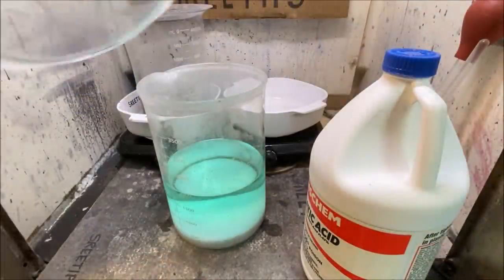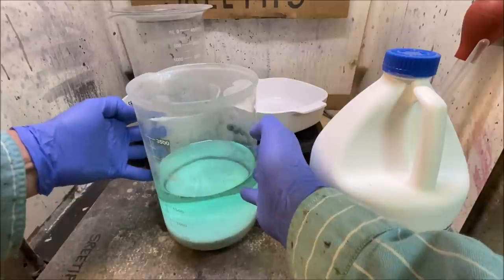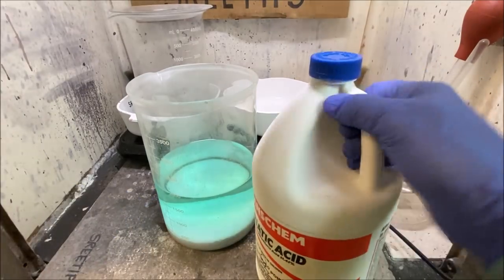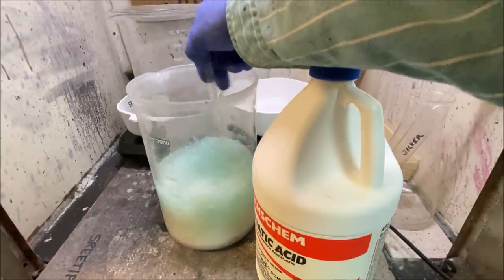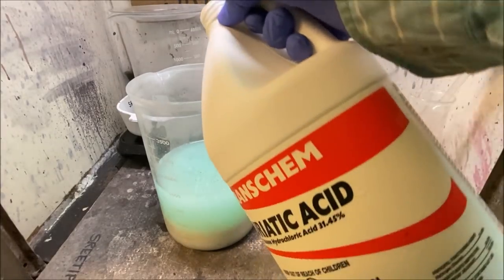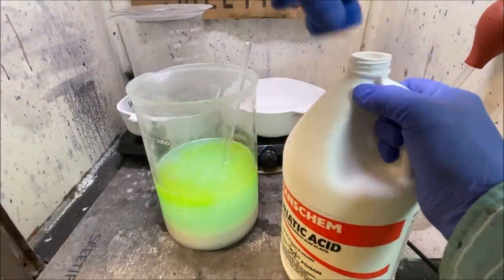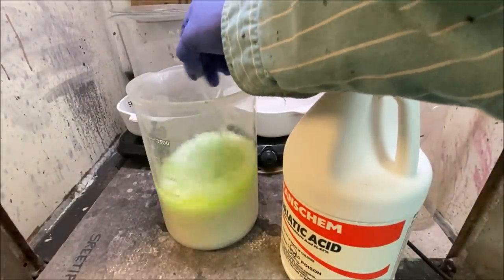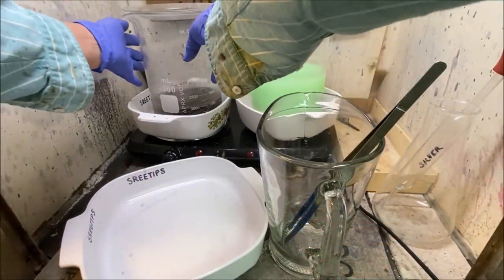A lot has happened since I started this experiment — it's been about three weeks. I transferred the solution from the filter flask into a large beaker and I've been adding hydrochloric acid to it. I think I've got silver chloride forming down on the bottom. I'm adding a little more hydrochloric acid to make sure all the silver is precipitated out. You can see by that color that all the silver chloride has precipitated out of the silver sulfate solution.